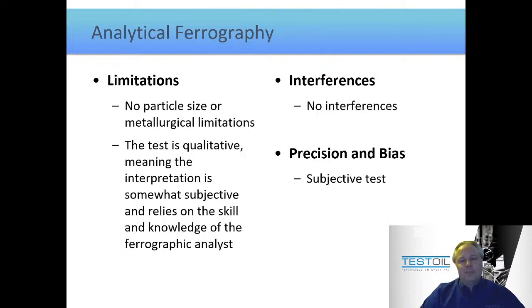Now, just to be well-rounded in our presentation here, the limitation to this test is it is a subjective, human-based test, but the nice thing is it does not have any significant interferences. So now let me go through the actual report that I'd like you to see.